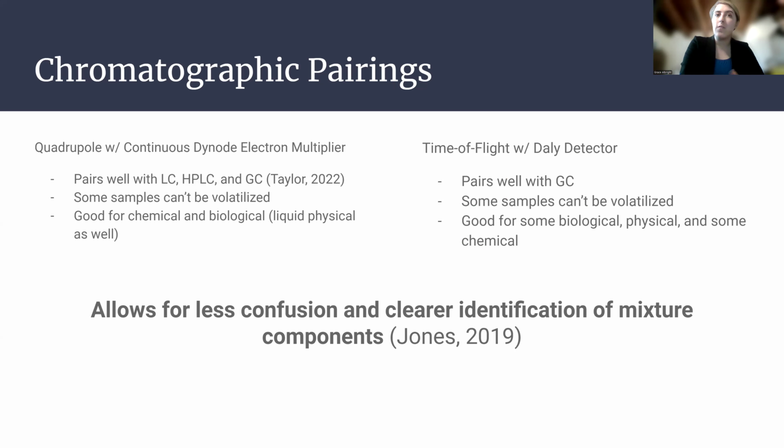It's very good, though, for chemical and biological samples and liquid physical as well. This is just because you don't want any degradation of the sample when going through the chromatography techniques. And it's very, very good, again, for that specific type of analysis.